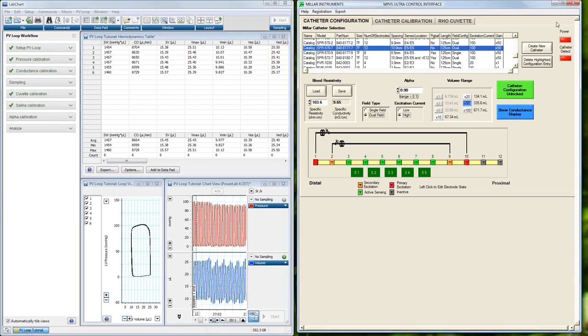So that kind of takes us to the end of everything I wanted to cover today. So it looks like we may have a few questions.